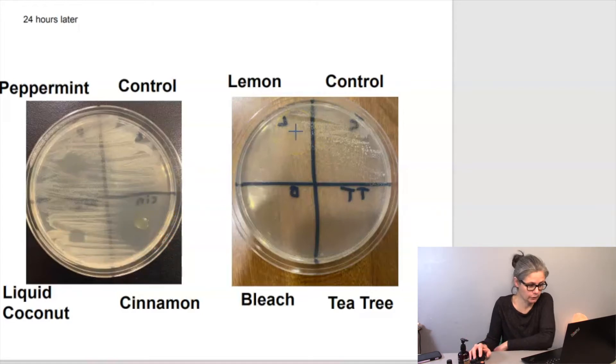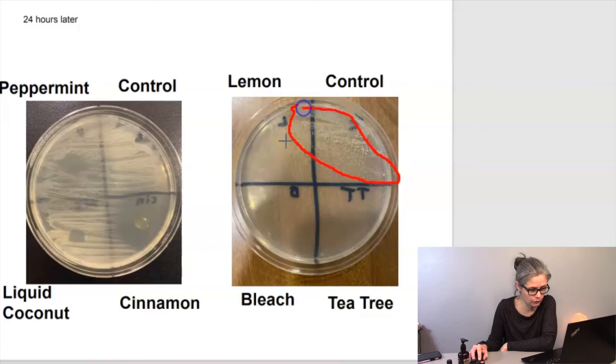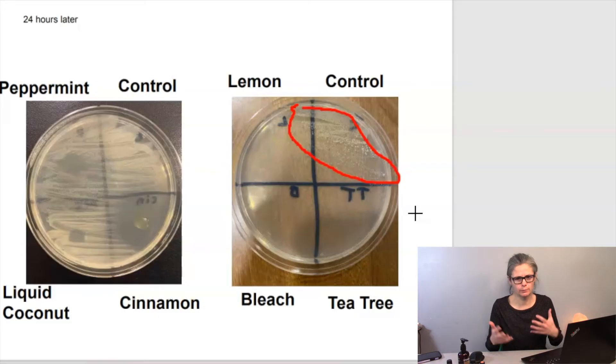Then I look at the next dish where I had the lemon, the tea tree, and the bleach. And again, I'm seeing this weird thing where there's just a little bit of growth around the control and then nothing in lemon, nothing in bleach, and nothing in tea tree. So I decided to do a separate dish for lemon and tea tree just to give it another try to see if it's really inhibiting the growth or if I had a problem with my swabbing.